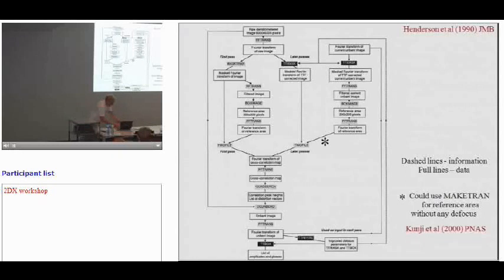So obviously, you can't go into too much detail, so I'm going to give you some snapshots of the different steps that are involved in that diagram. So the MRC programs, again, the philosophy there was not to structure it into a single package where you press the button and go. We wanted to look at different stages to see whether it had worked.